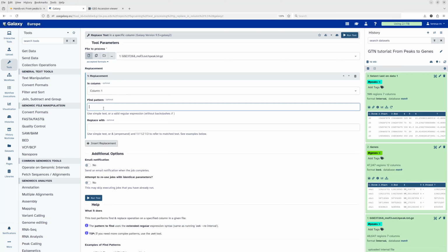So we want to find a pattern that is within the alphabet from 0 to 9, so whatever number. And we can also have more than one number. So this regular expression tells you in the brackets, whatever alphabet it should search for, so this time numbers, and it can be more than only one number. This is specified by the plus.